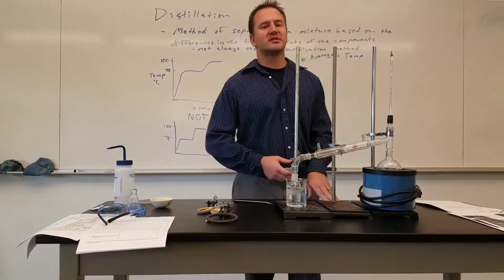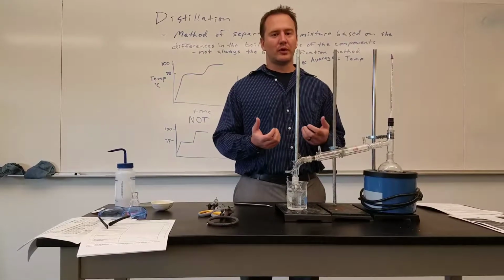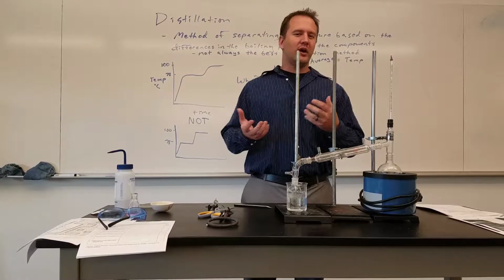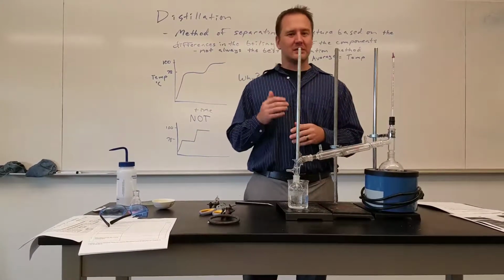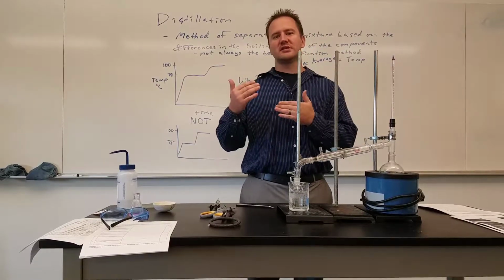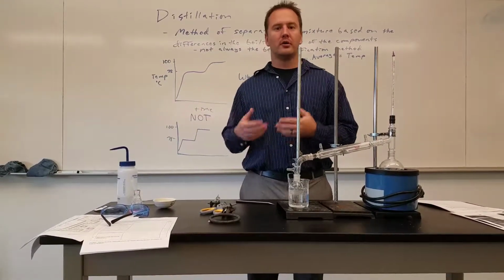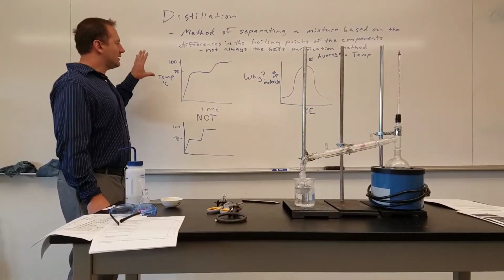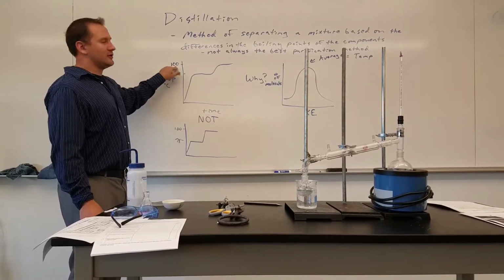It also works for separating mixtures of liquids that have different boiling points. The bigger the difference in boiling point, the better it works. If you have a mixture where the components are somewhat similar in boiling point, it gets a little bit messy, but it still helps to separate. And if you repeat this process several times, you'll get a more and more pure isolated sample that you're looking for. So, say you were heating a mixture that contained a liquid that boiled at 78 degrees Celsius, and you had that in water.